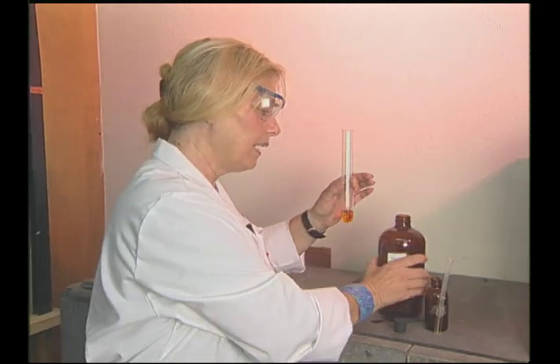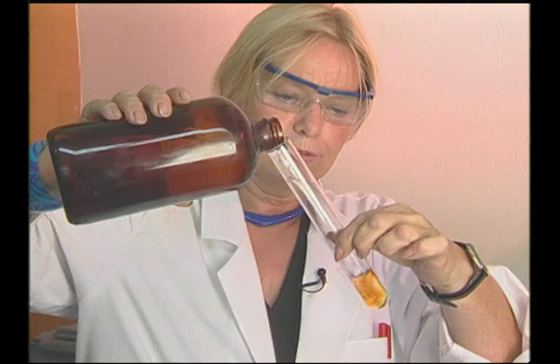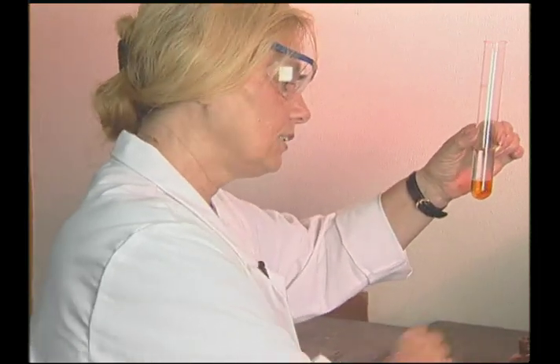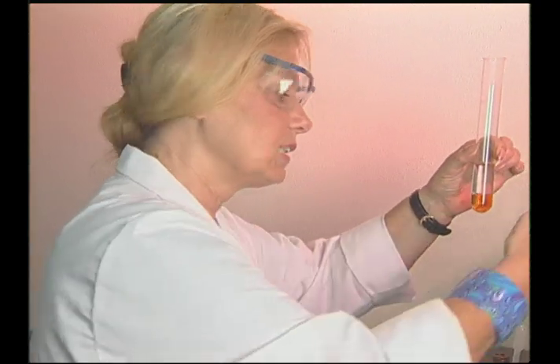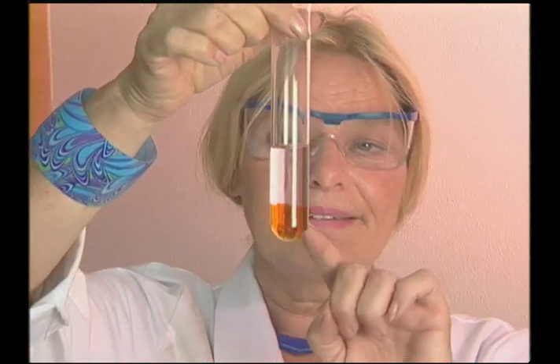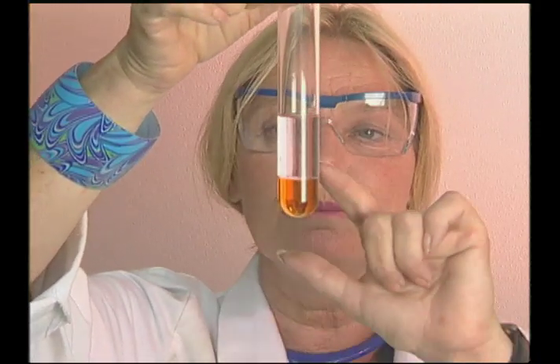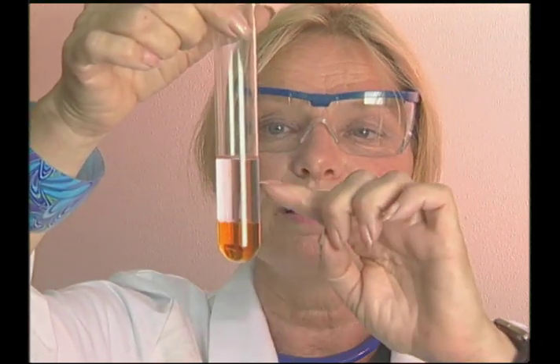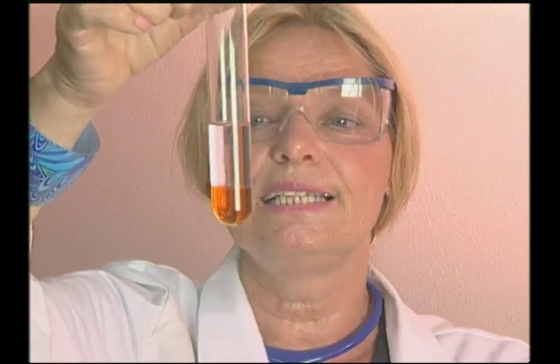And I'm going to add now hexane. Smells very organic. And I'm going to pour it onto this aqueous iodine solution. I better stop this because the vapors are not very healthy. So we see here, nothing happened much yet, but you definitely see the beautiful interface. Now, which do you think is the less dense liquid? Well, obviously the one that is on top, and that would be hexane. So hexane has obviously a lower density than water.